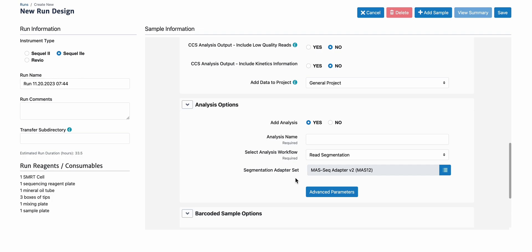I'll explain in a separate video how, after resegmentation, we can further demultiplex the sample — the multiplex of 16S amplicons. So that is the demo for sample setup and run design for the Kinex libraries.